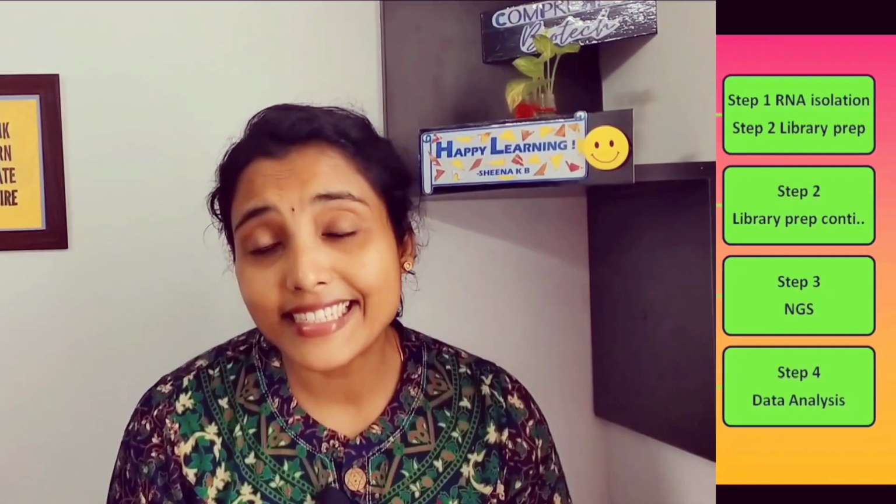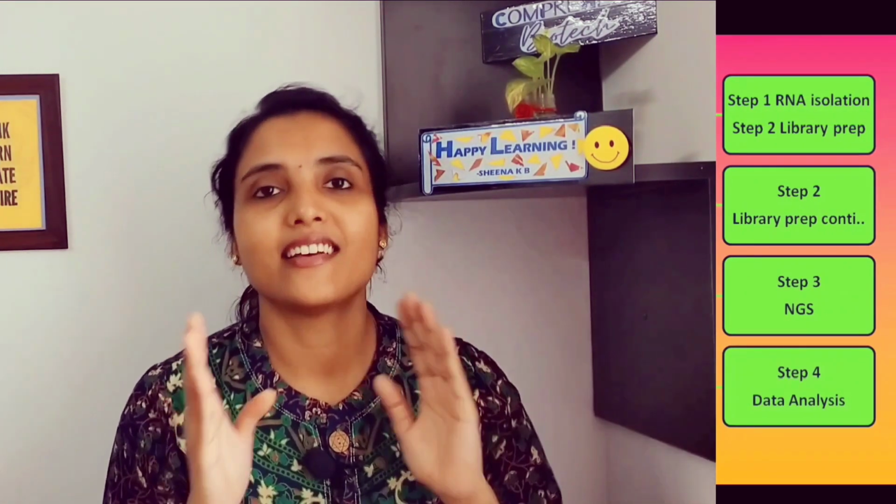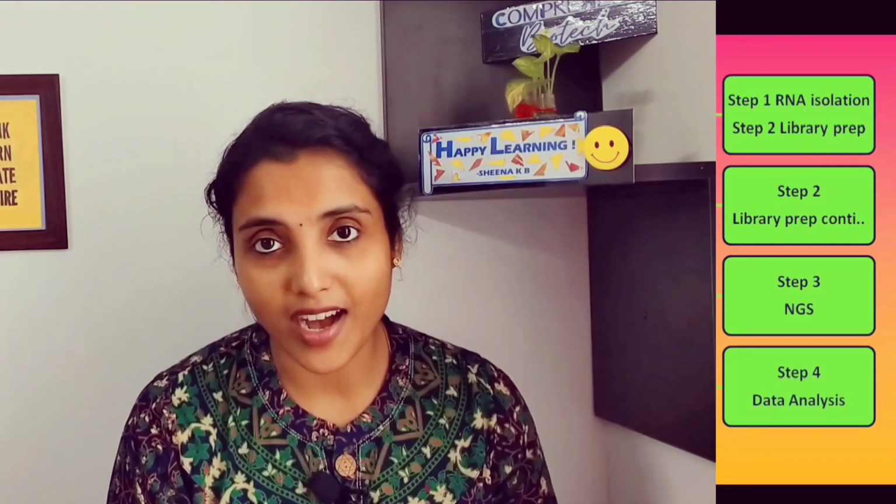The topic for discussion today is RNA-seq or RNA sequencing. This session is specifically designed for undergrad students to understand the basics of RNA sequencing. It's kind of like an introductory class. Now, RNA sequencing has four major steps. Isolation and selection of RNA species, library preparation, next generation sequencing, and data analysis.